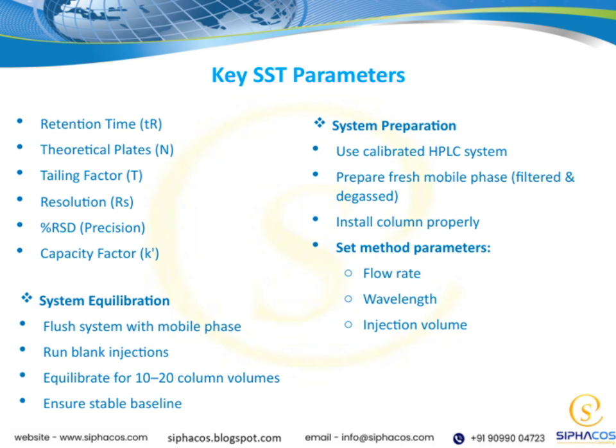Connecting all these points, proper system equilibration and preparation are the foundation for obtaining accurate, reliable data. Monitoring key SST parameters ensures your method performs consistently and helps you troubleshoot if results deviate. This process is central to achieving quality in your analytical work.